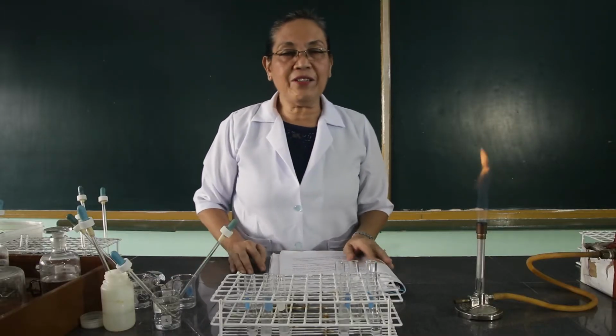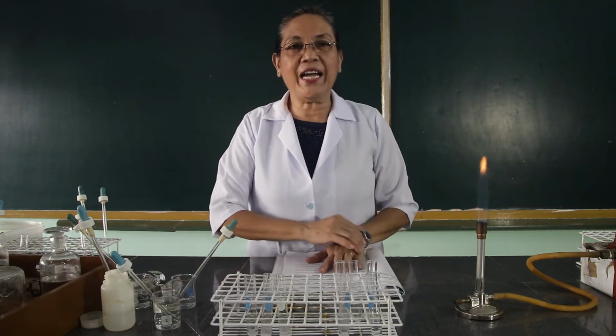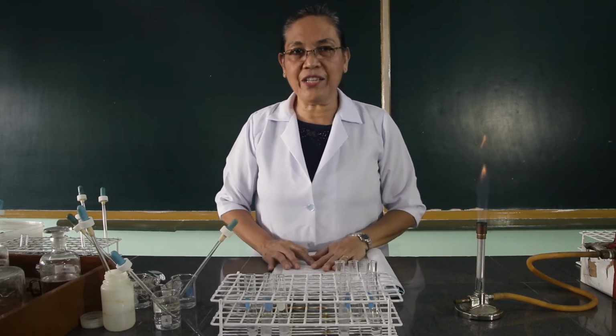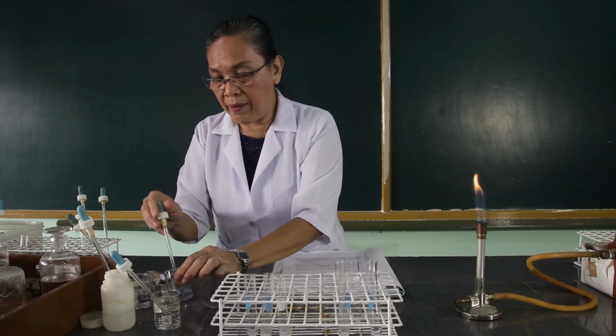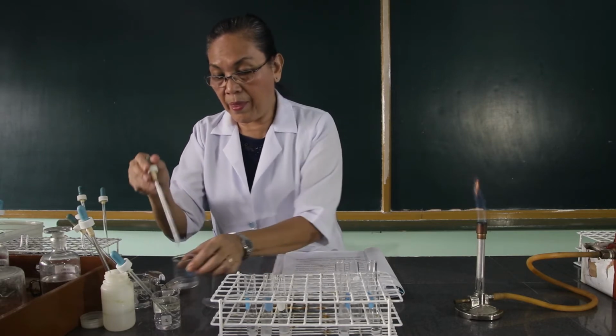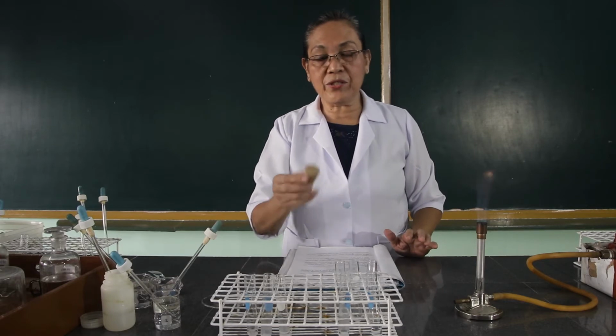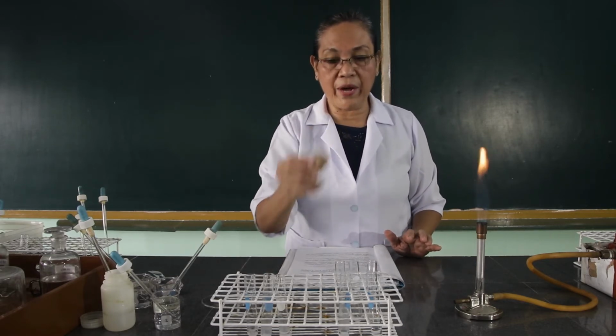So we have analyzed already the calcium ion. Then we're going to apply a flame test for calcium. Again, because we're going to apply the flame test, we have to clean again our nichrome wire.